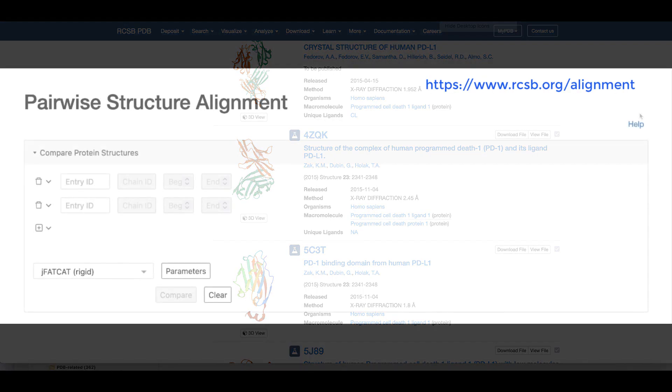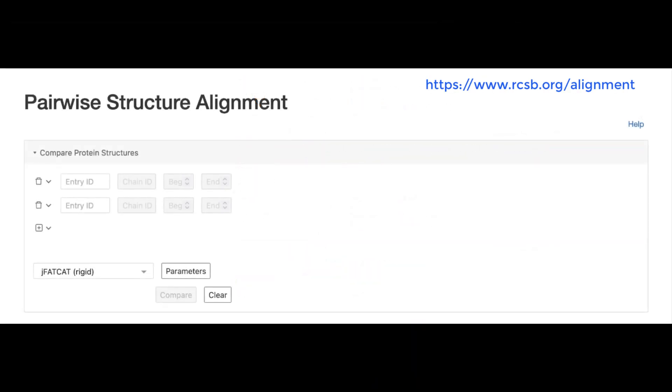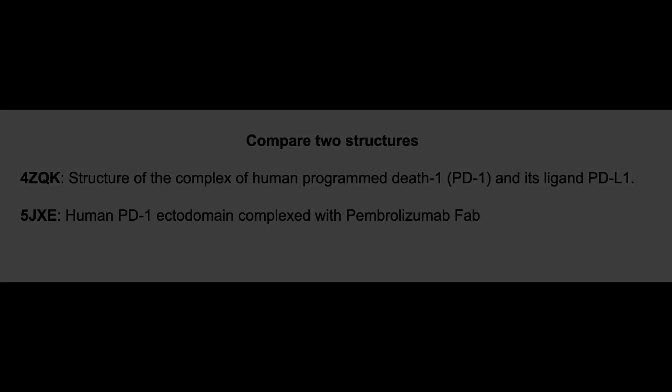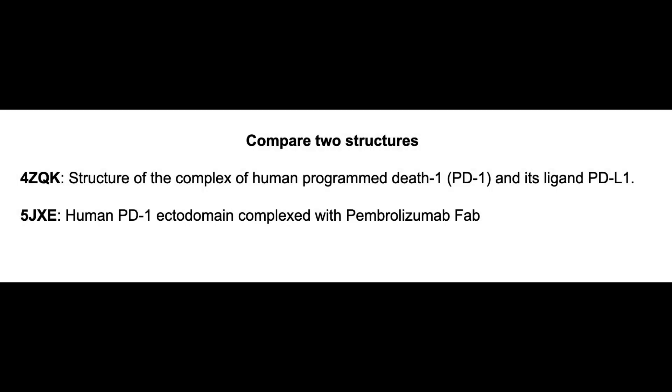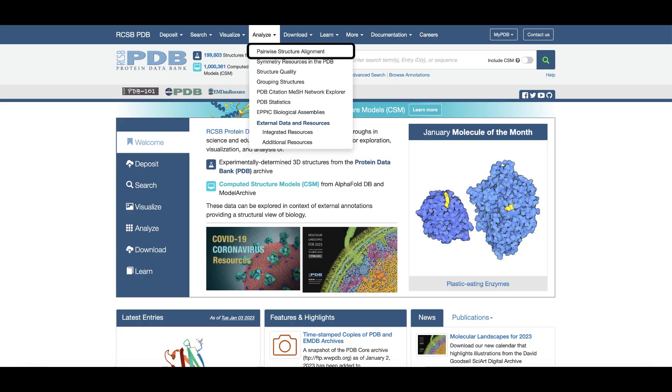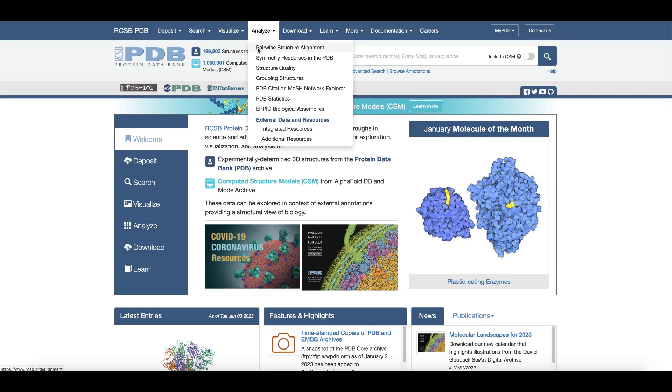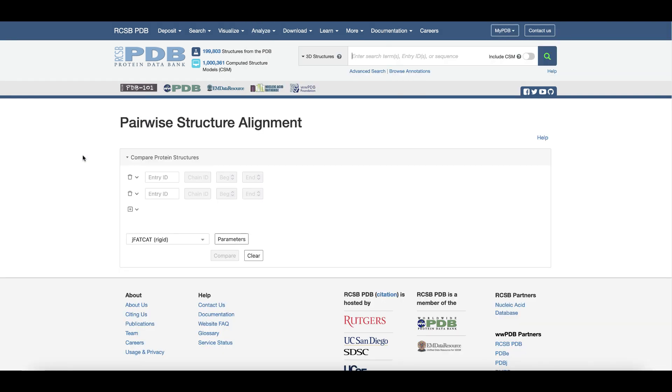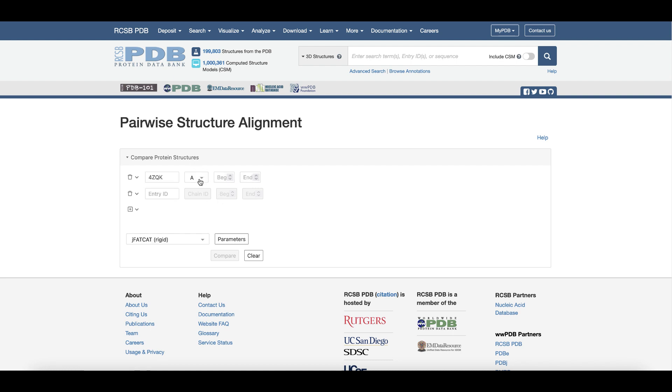Let's use the rcsb.org pairwise structure alignment tool to compare the two structures of PD-1, one bound to PD-L1 and the other bound to pembrolizumab. Click on the analyze menu at the top of the page to open the tool, type in the PDB IDs 4ZQK and 5JXE, and select the chain IDs corresponding to PD-1. Run the tool using default options.